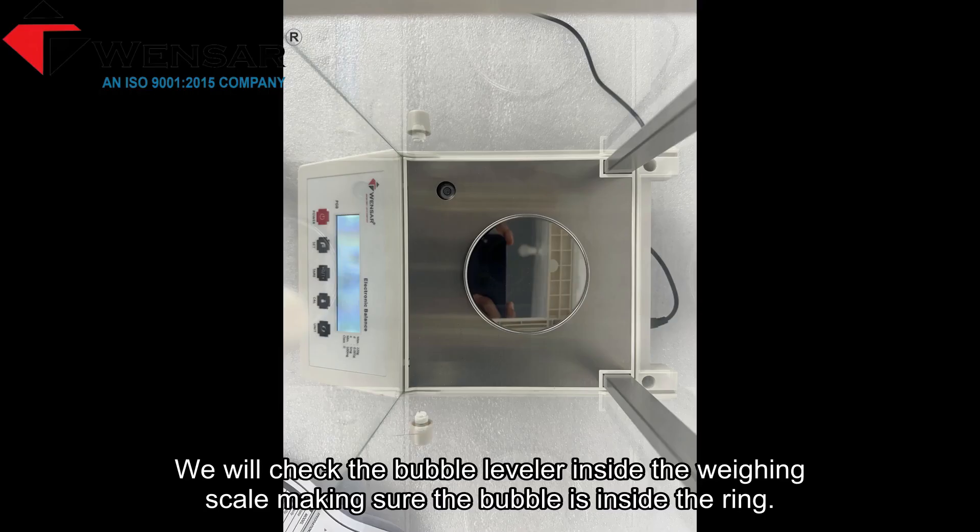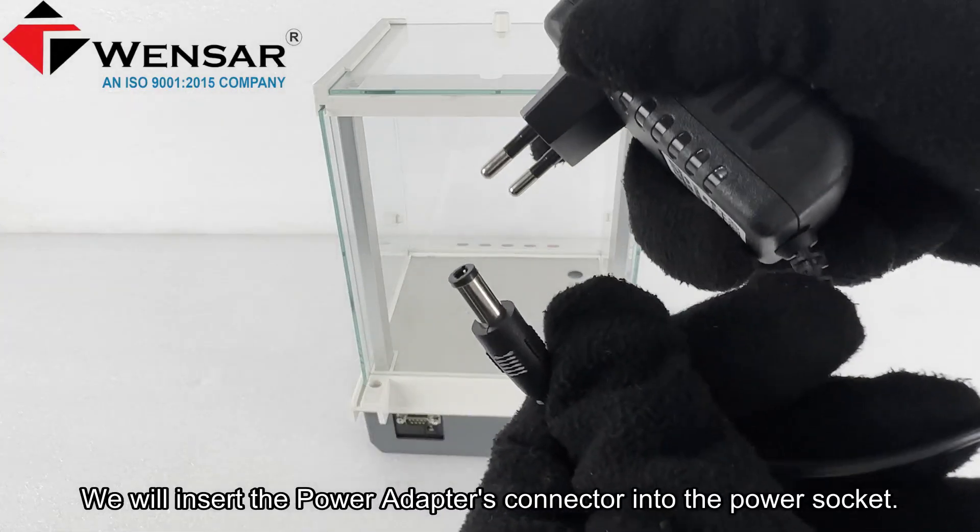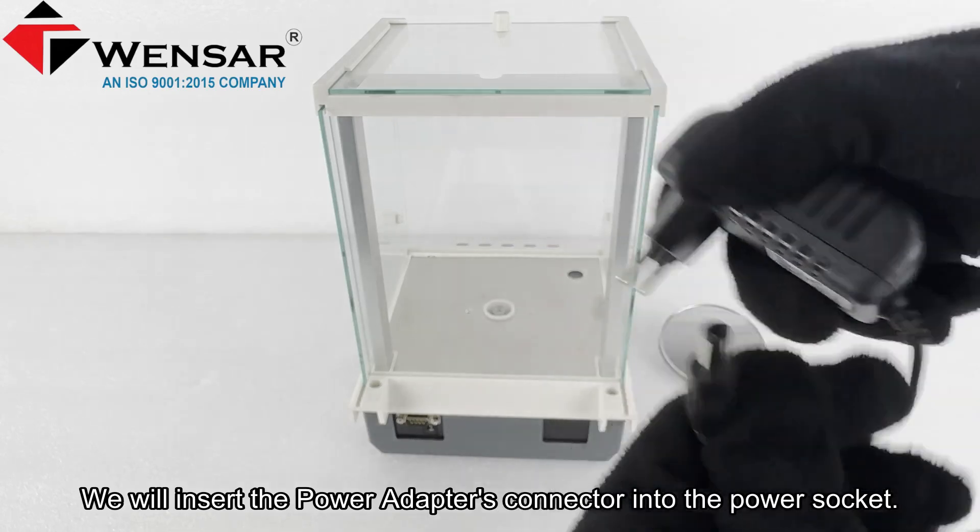We will check the bubble leveler inside the weighing scale, making sure the bubble is inside the ring. We will then insert the power adapter's connector into the power socket.